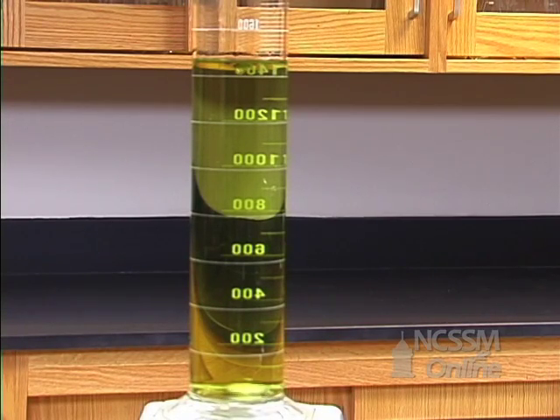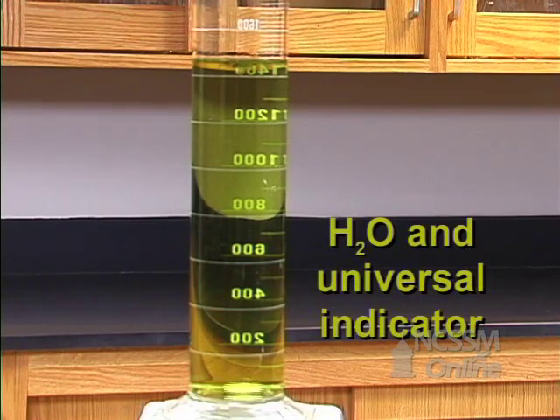Acid-base indicators are compounds that change color at different pHs. I've added some water to the graduated cylinder, then added some universal indicator, turning it green.